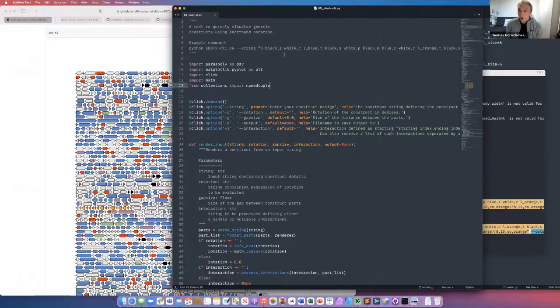You could create your own glyph, or you can just wait for it to be ratified and it automatically gets sucked up into the tooling. So it's really trying to remove a lot of the bottlenecks which have kind of hampered the standards. It's grown to a size which becomes kind of unmanageable doing things manually, if that makes sense.